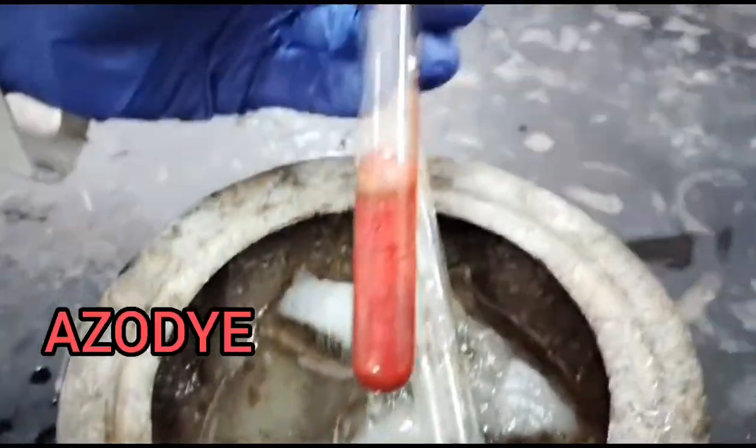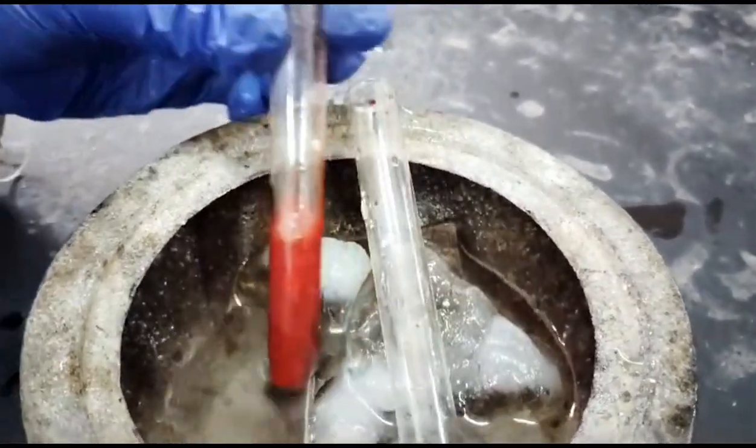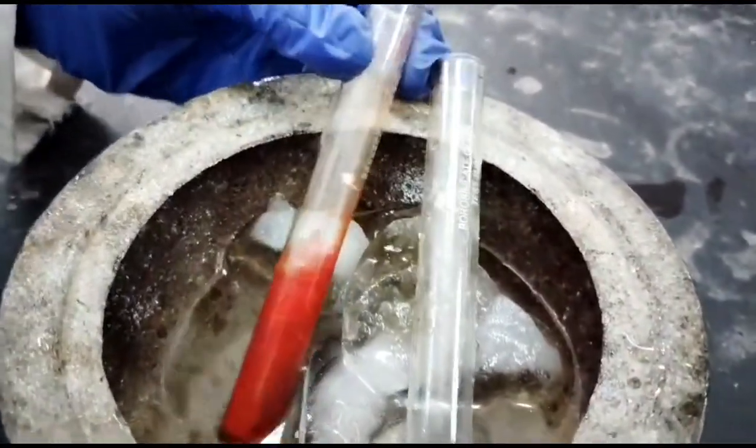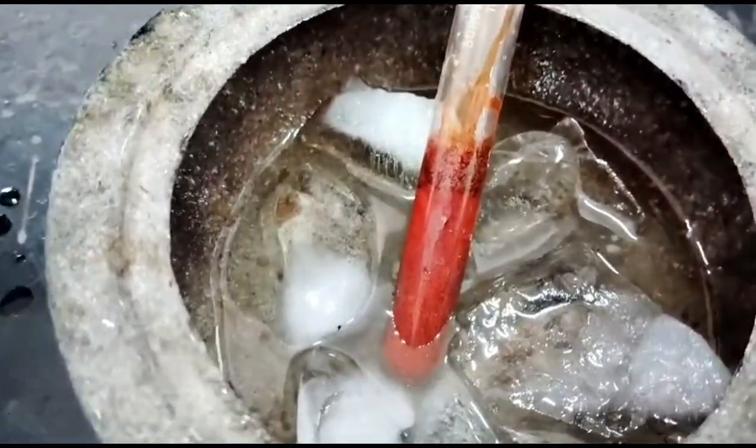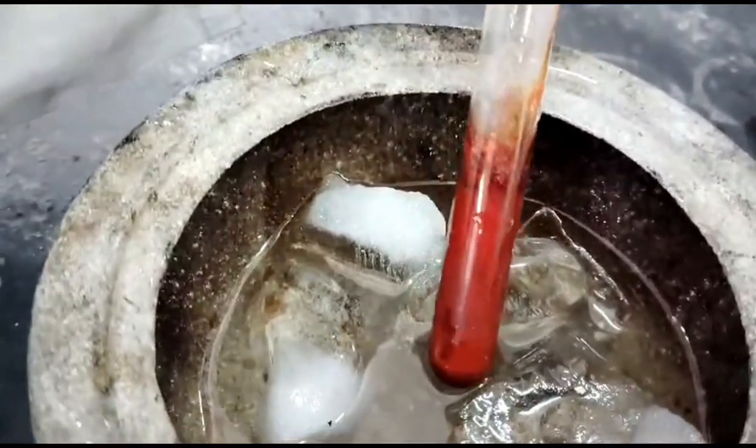Now you can see the red dye. It is a very vibrant red color. As you can see, the vibrant red color of azo dye, and we should not remove it from the ice bath since it is unstable at higher temperature and it will decompose.